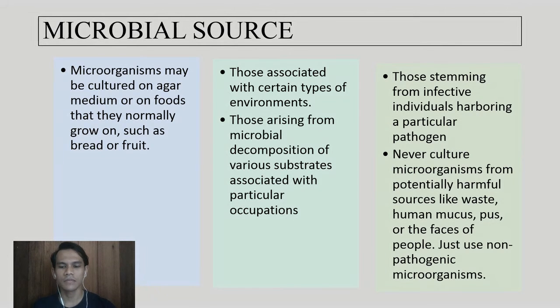Never culture microorganisms from potentially harmful sources like waste, human mucus, pus, or the feces of people. Just use non-pathogenic microorganisms only.